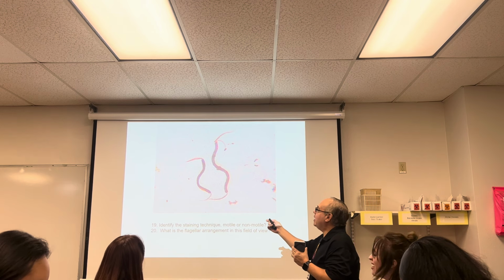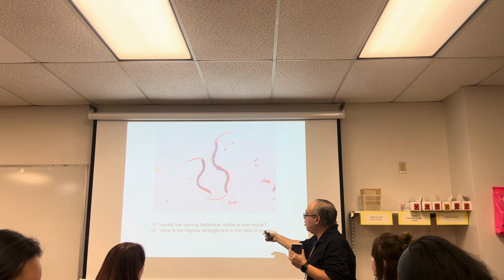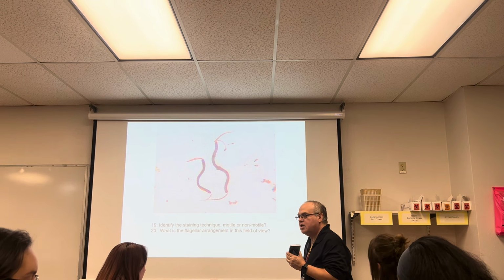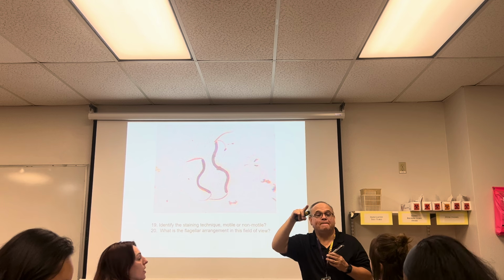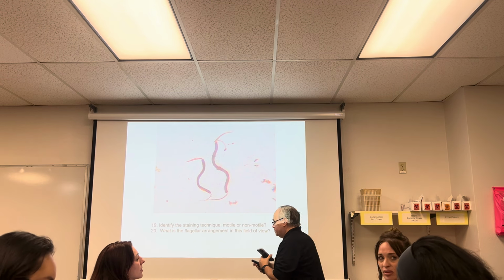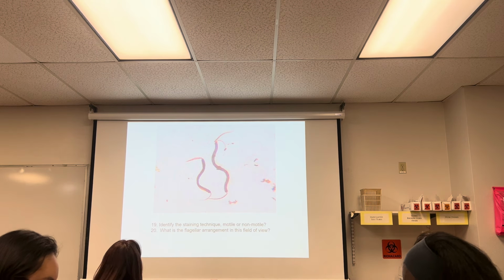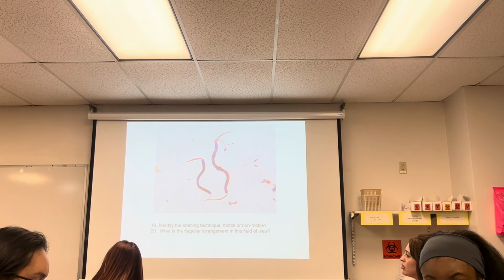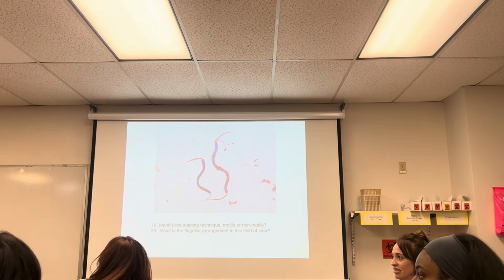Just because that's telling you what it truly is. One of them either broke off or it's behind here and we can't see it because we're only looking at one plane. Okay? Lophotrichous. You want to spell it? Lophotrichous. Can there be more than one at both ends? Yeah. I thought it was like one and one.